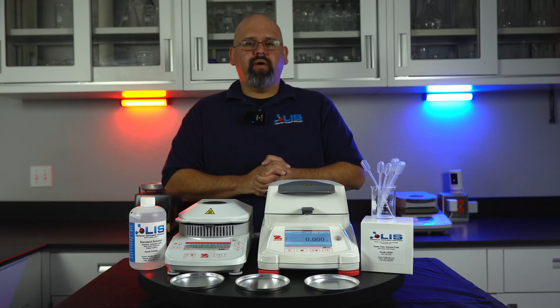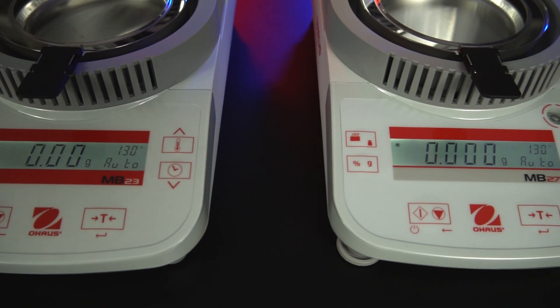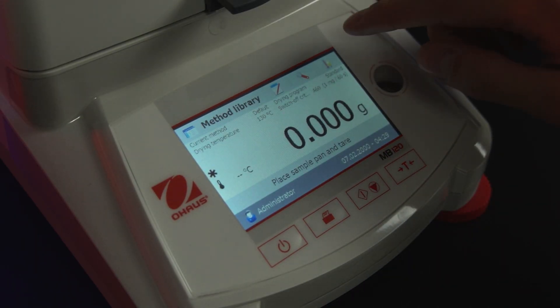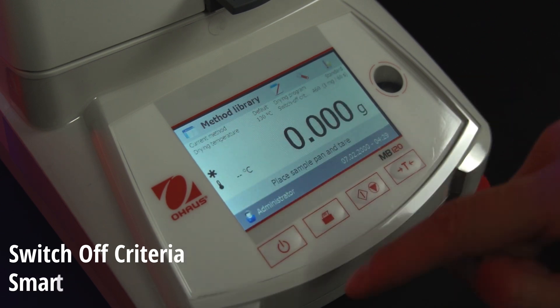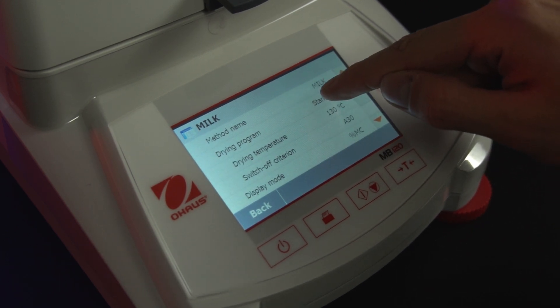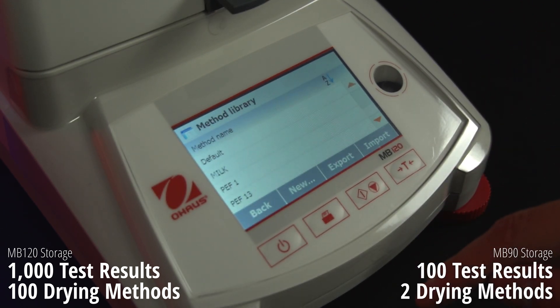Now I want to quickly show you how to operate them. The operation handling for both the MB-23 and 27 are the exact same, and the same goes for the MB-90 and MB-120. However, the MB-120 does have a couple of added software features called switch-off criteria and the smart temperature guide, which will allow you to get much more accurate results when using the device on a variety of samples. It can also store up to 1,000 test results and 100 drying methods, while the MB-90 will only store 100 test results and 2 drying methods.